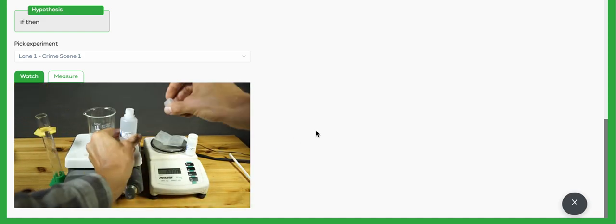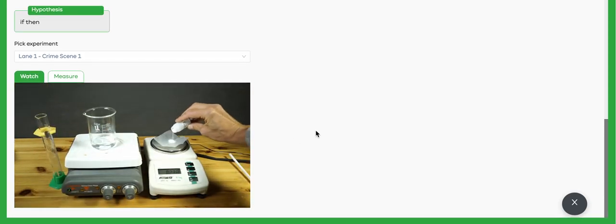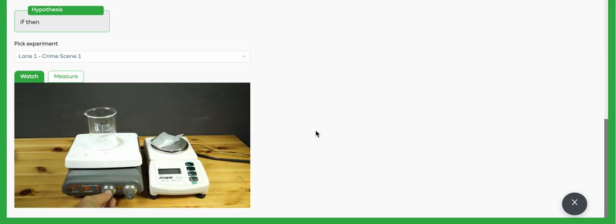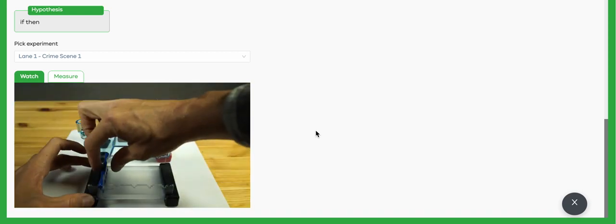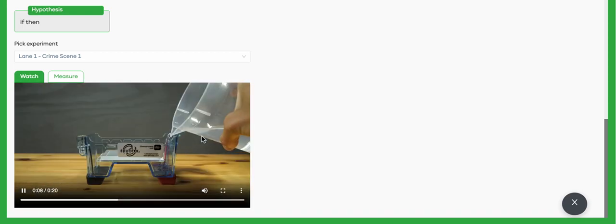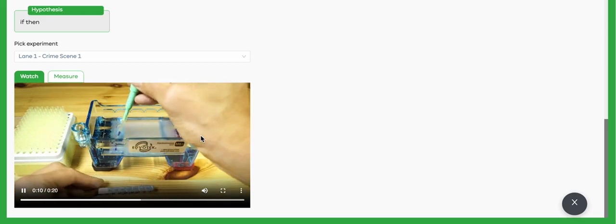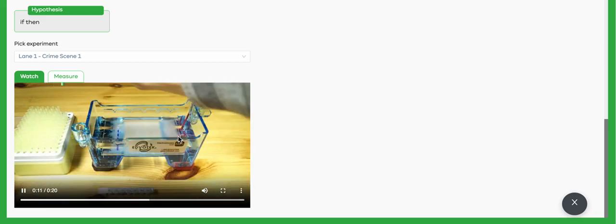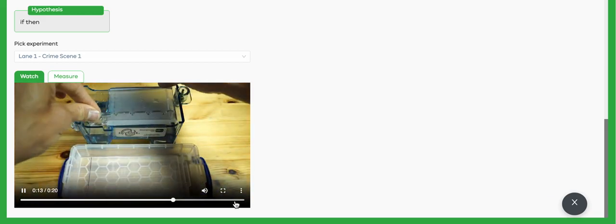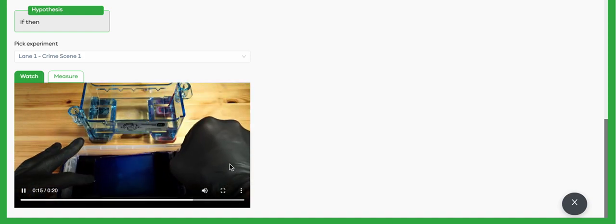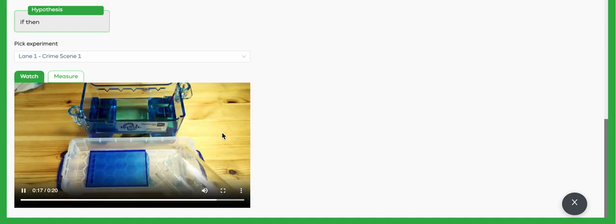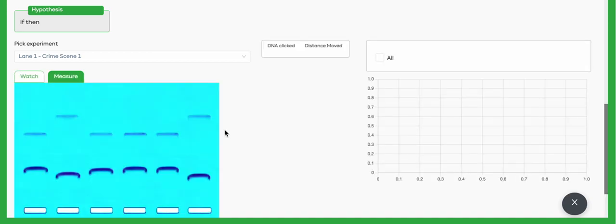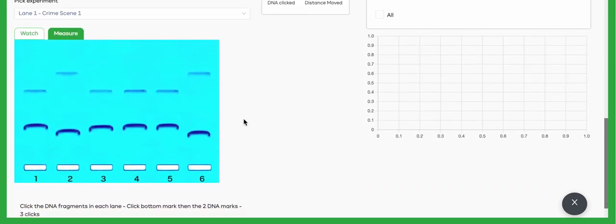The video is very simple; it just shows you how to set up the gel electrophoresis in each case. Okay, so that's going to go through a pretty involved procedure, about 20 seconds there, and that's sort of sped up with a lot of time-lapse. Finally, when that's done, you're going to see the gel and the results of the experiment itself.